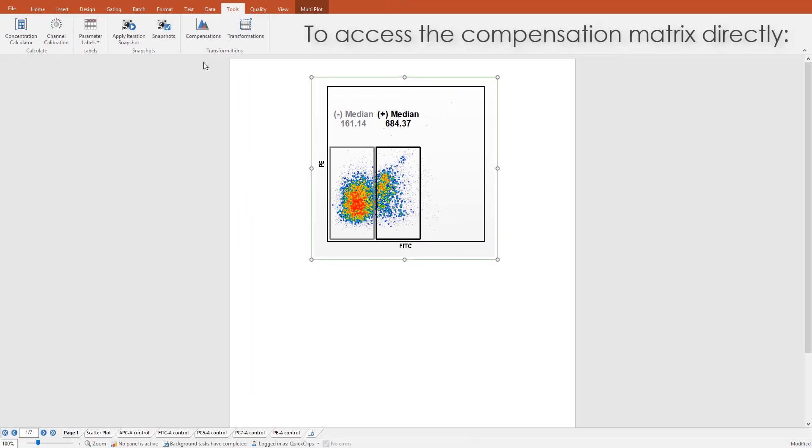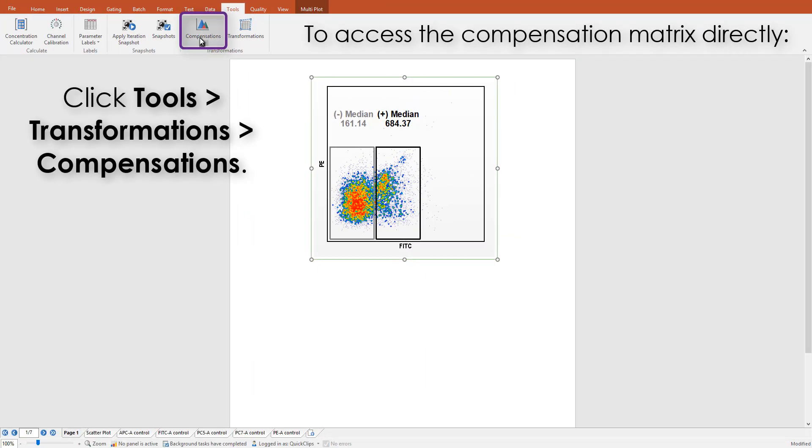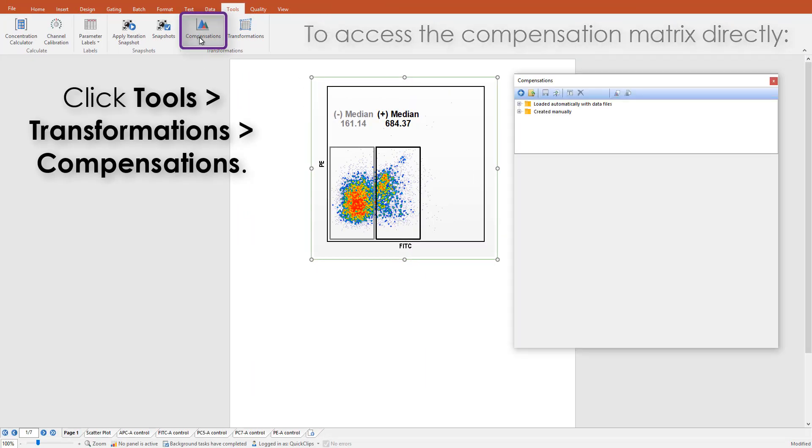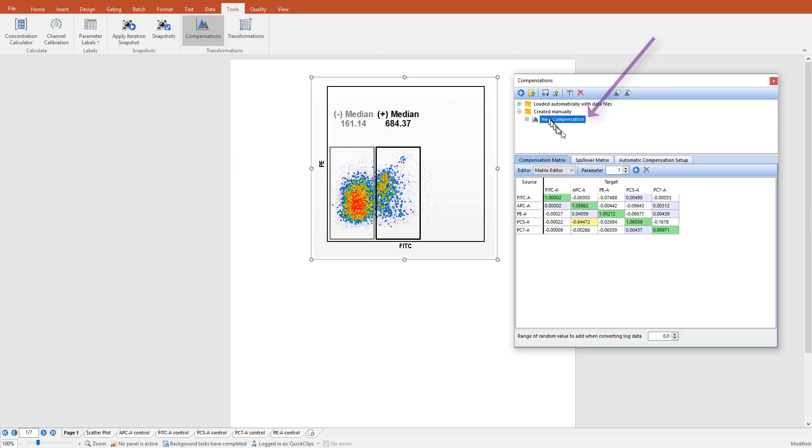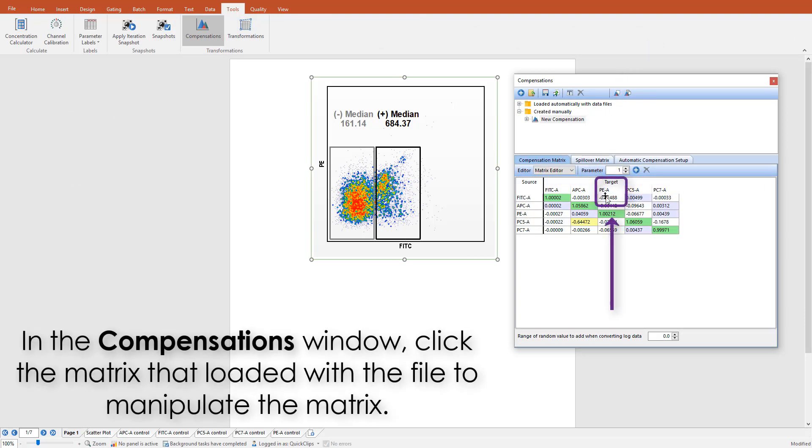To access and edit the matrix, click the Tools tab in Compensations command. In the Compensations navigator, click the compensation name to be edited and adjust the values with arrows or manually entering a value.